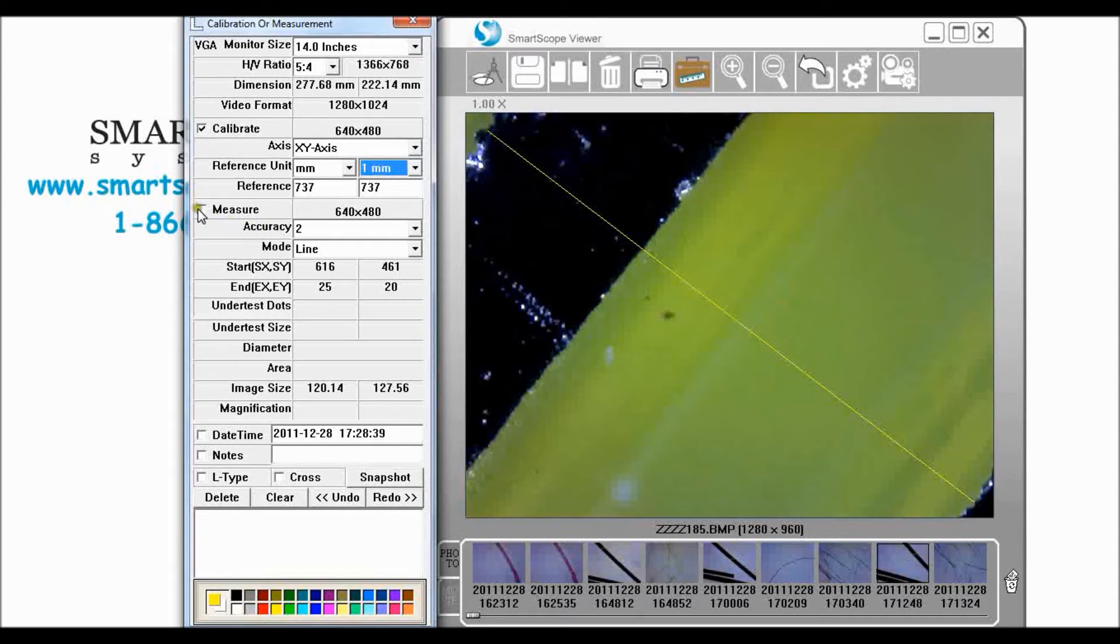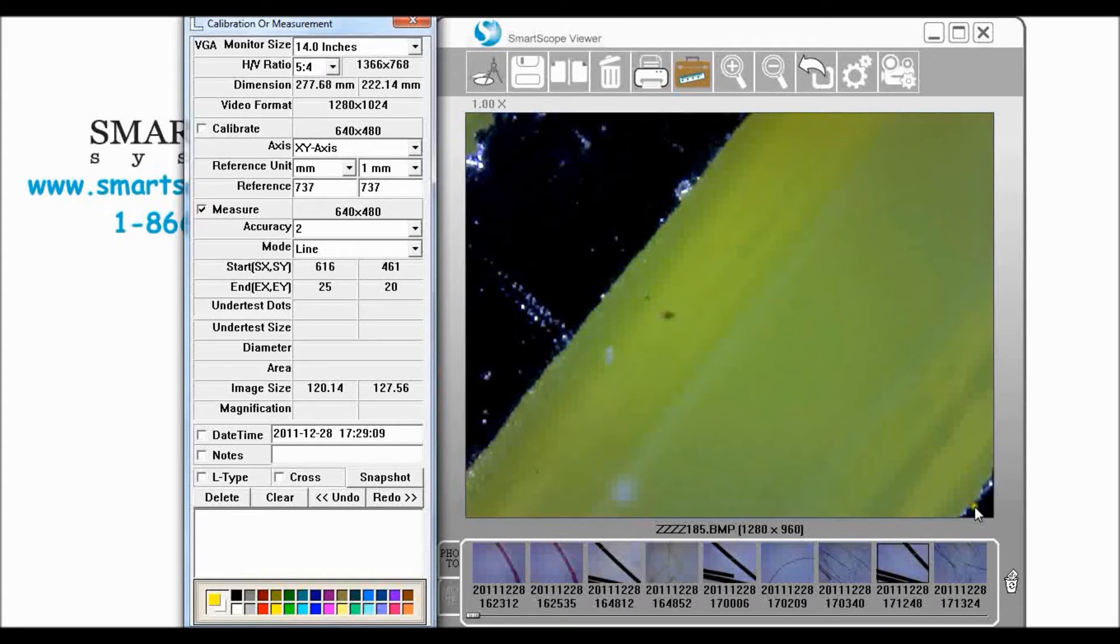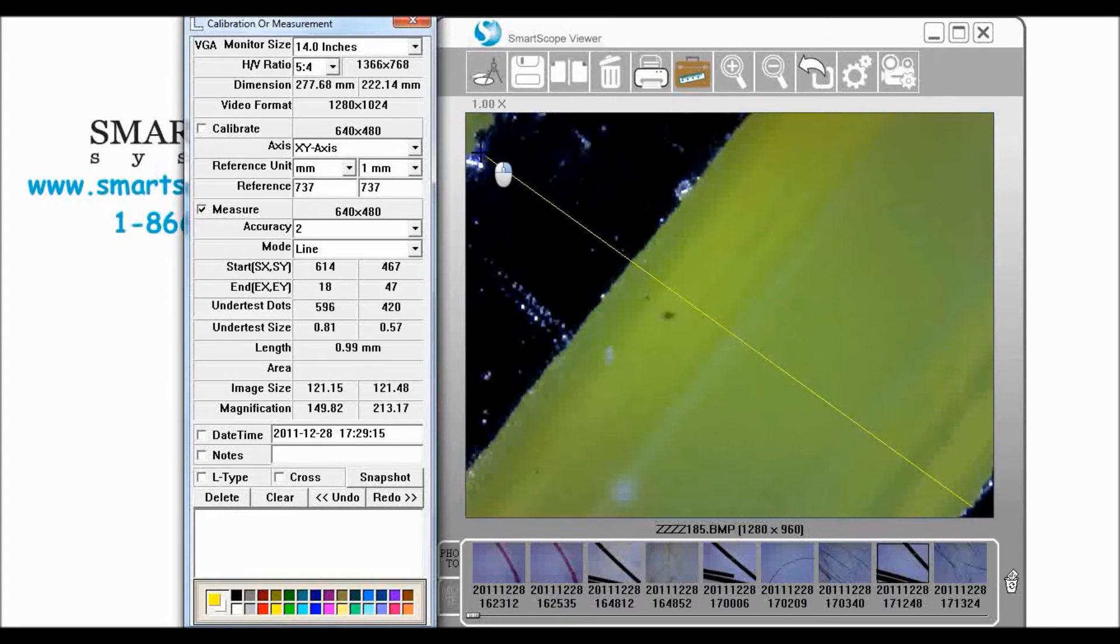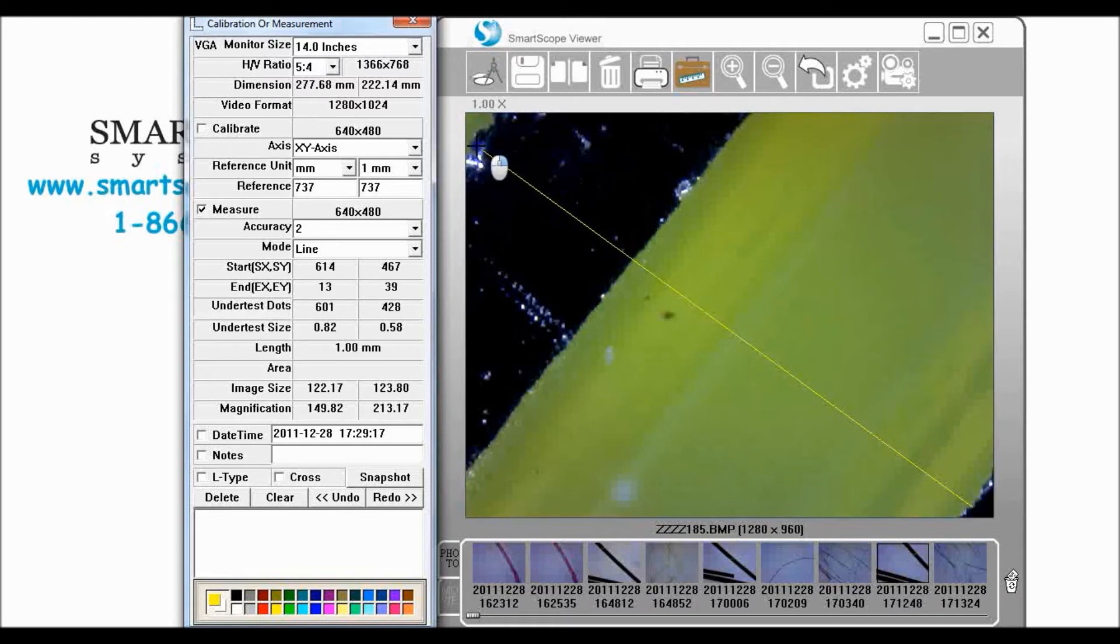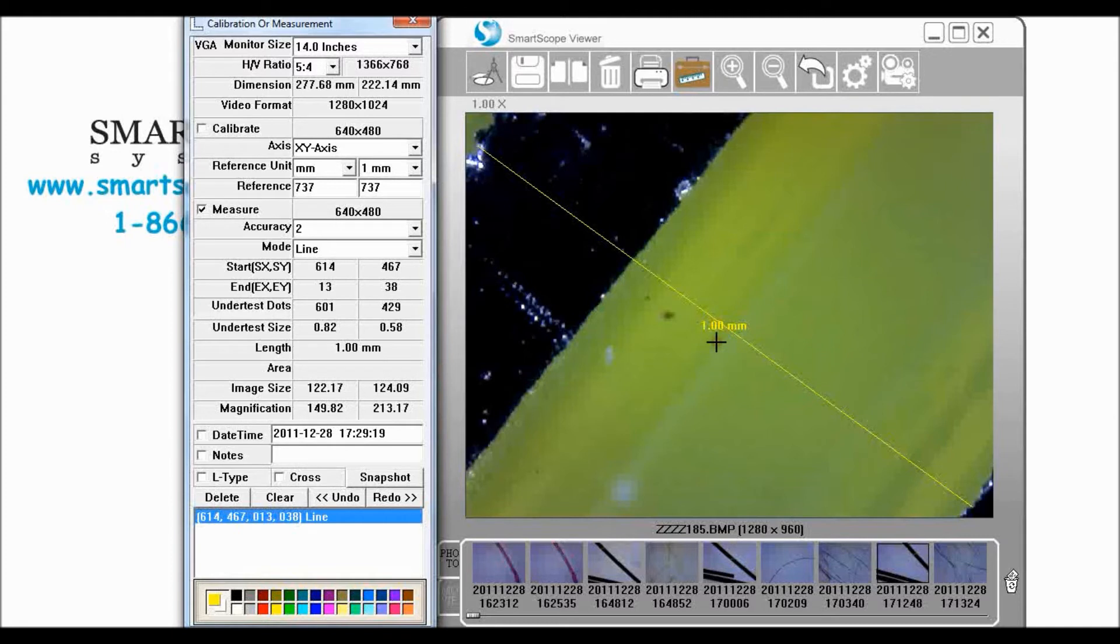So we can check that by coming down and click measure and come down, right click again, come up into the left edge of that one more time and release. Exactly one millimeter.